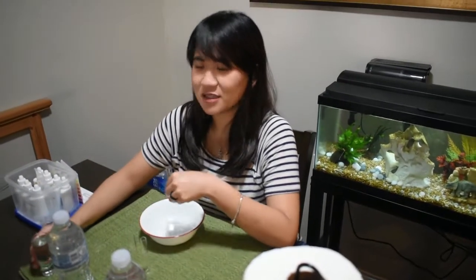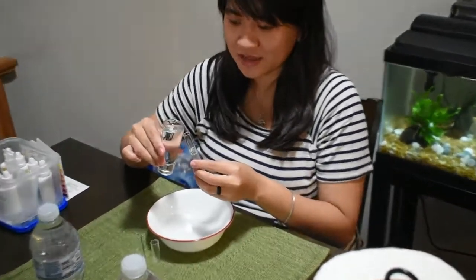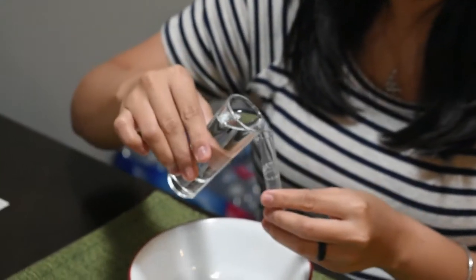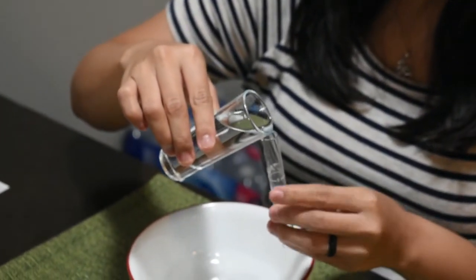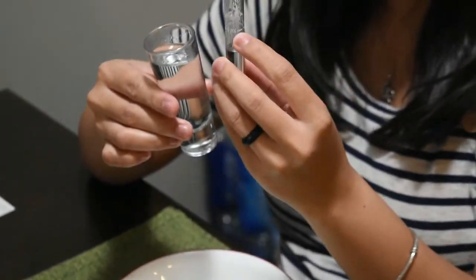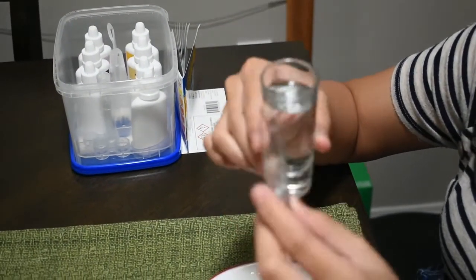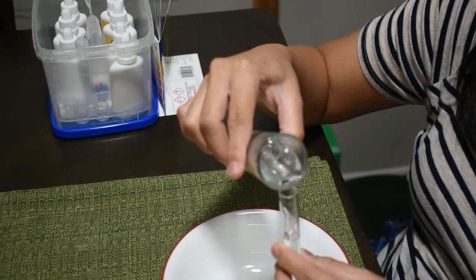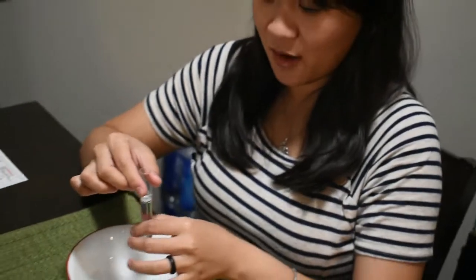So we are doing the test now. First, this is the tap water. I will pour that in the testing glass. There is a line in here, 5 milliliters. So we need to put the water right at the line of 5 milliliters. Yep, that's perfect. And this is the tap water.